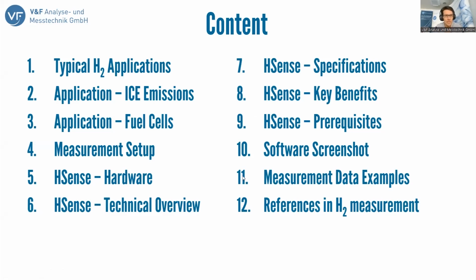I see people coming. We're going to go through how the measurement works, which hardware components are in this instrument. We're going to look over specifications, benefits, and also customer prerequisites which we need to have in order to operate this instrument on site at a customer.